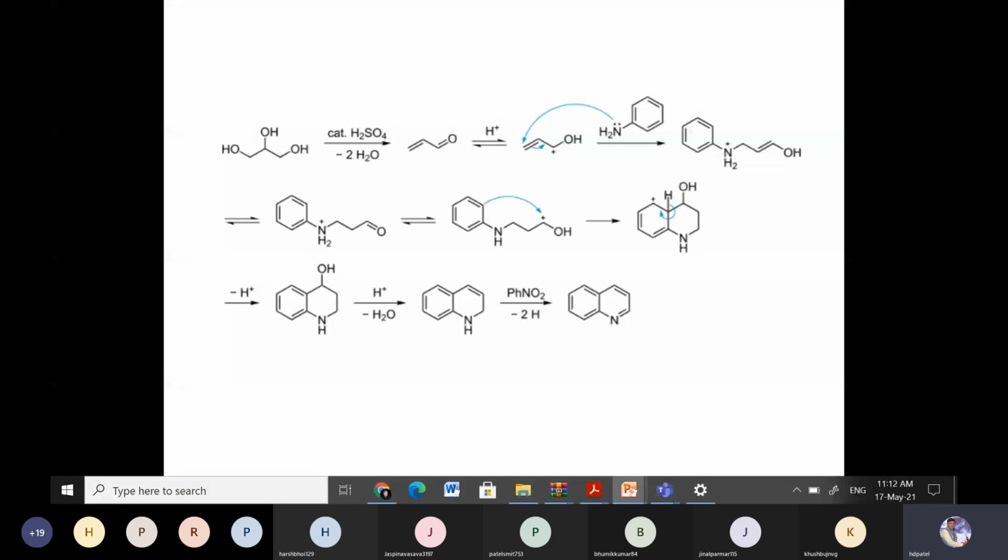When we add HCl and ZnCl2, they react with each other and form a zinc salt, which is water insoluble, and also insoluble in an organic solvent. So what we have to do is add ZnCl2 and HCl. Before that, if we want to neutralize the reaction condition, we can neutralize with NaOH. Once we neutralize, then we add ZnCl2 and HCl. Heat it.